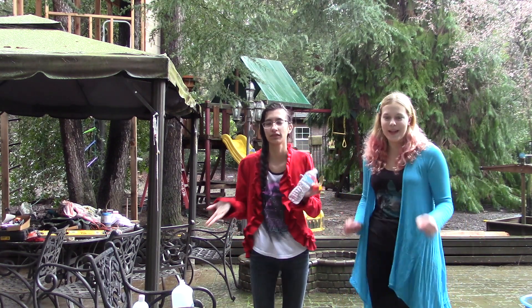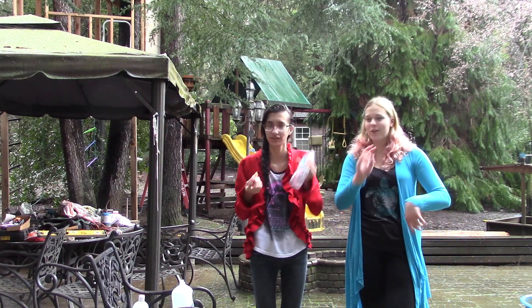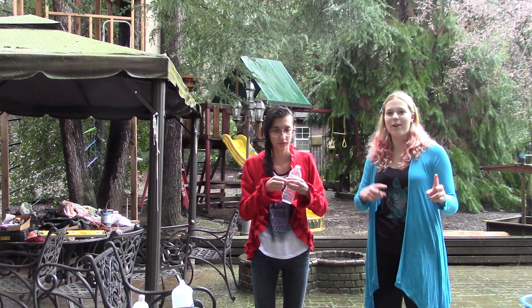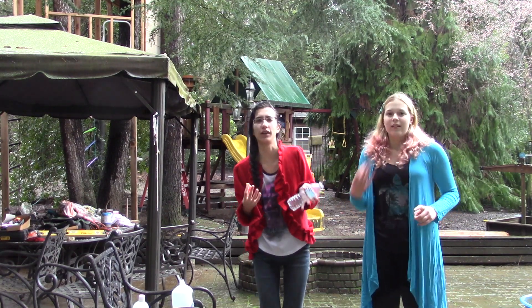So this is part two of Elephant Toothpaste, and C is going to do the first. We're going to do it twice. We did it the first time with 6% hydrogen peroxide, just like regular drugstore hydrogen peroxide.